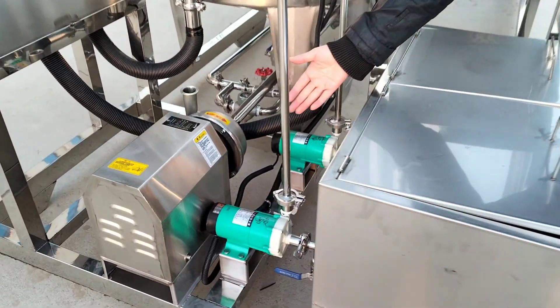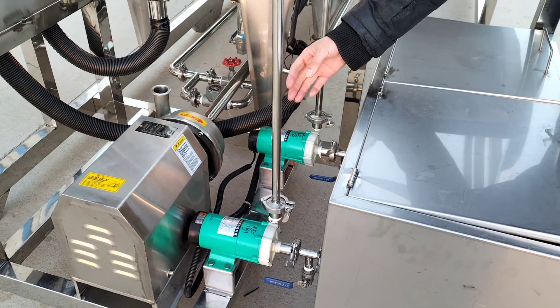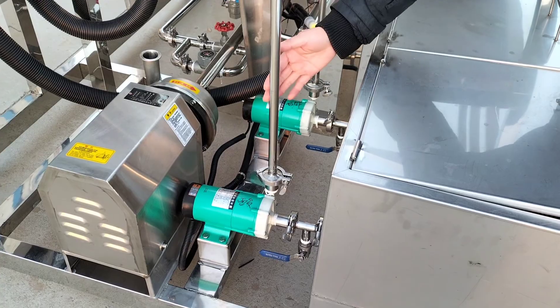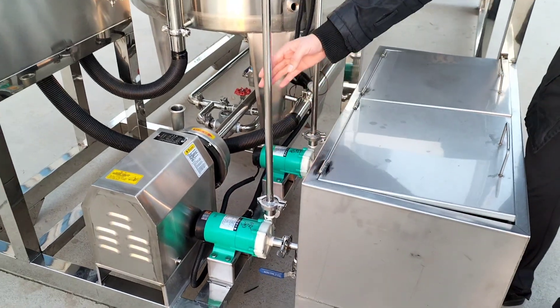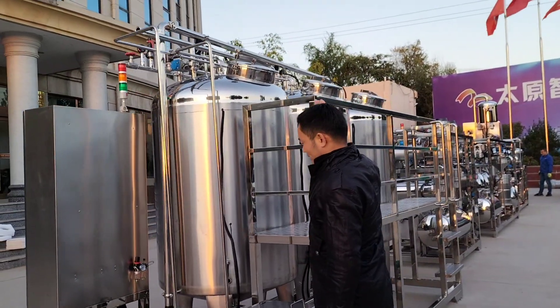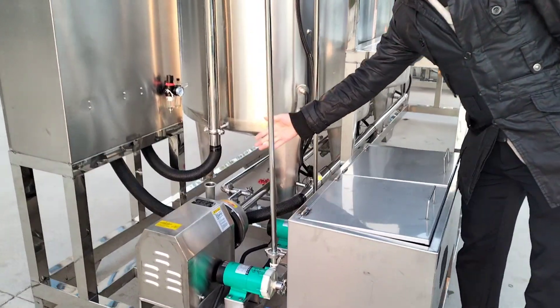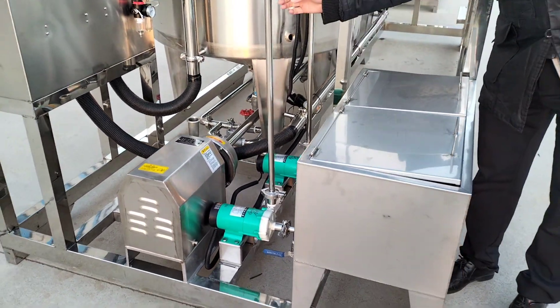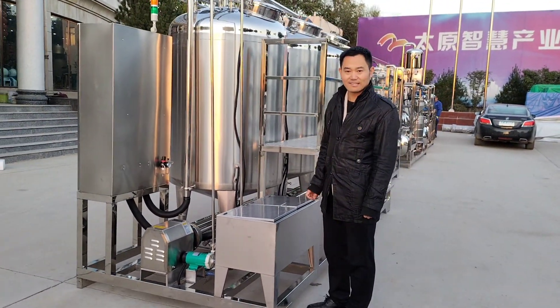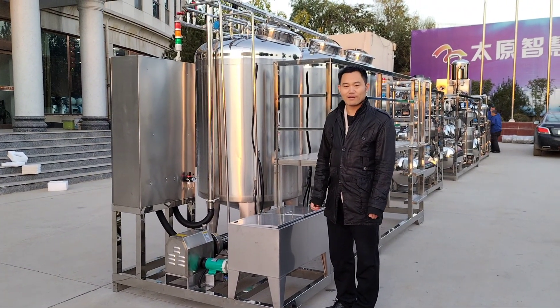Here we can see there are two pumps. It is an anti-corrosion pump, and the strong acid will use this pump, flowing to the acid pump and the alkaline pump. And here is one big pump.